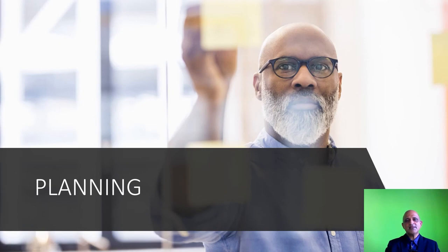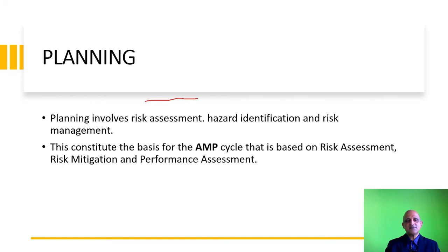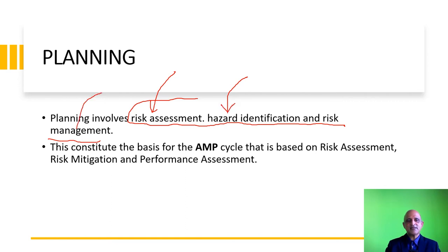We now move on to planning. Planning involves risk assessment, hazard identification and risk management. We first conduct a risk assessment, then identify hazards, and move on to risk management — we will cover this entire cycle in the second week of this MOOC. This constitutes the basis for the AMP cycle: risk assessment, risk mitigation, and performance assessment.